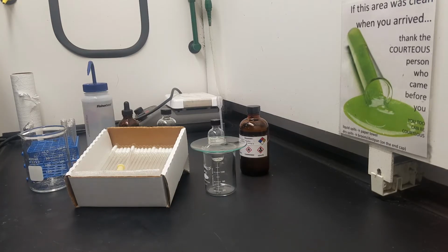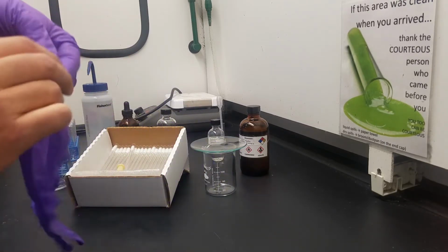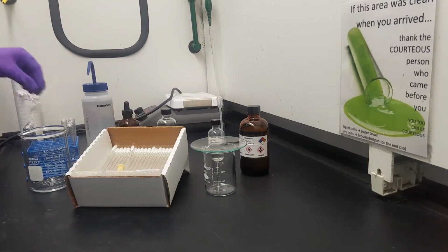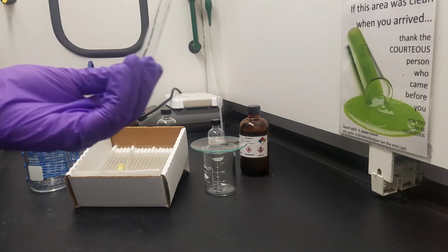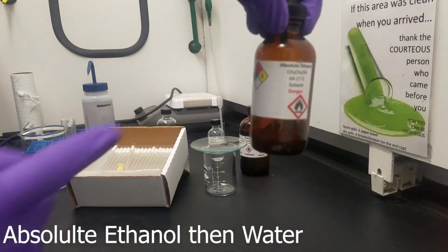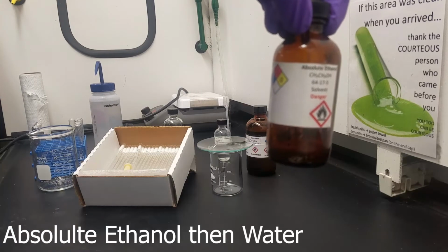So first we've got our lab set up. We got a glove up, so we got to put on our gloves and get ready to go to make sure we are protected. We'll see a close-up of each of the test tubes. Note this one has a little bit of water in it. That's okay because we're just going to mix it with water anyway.